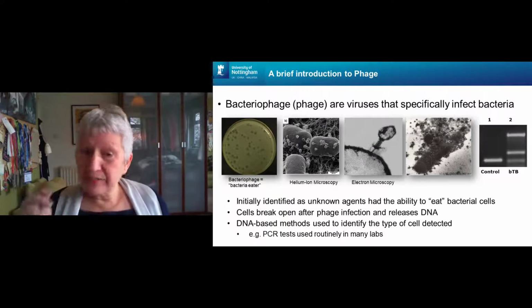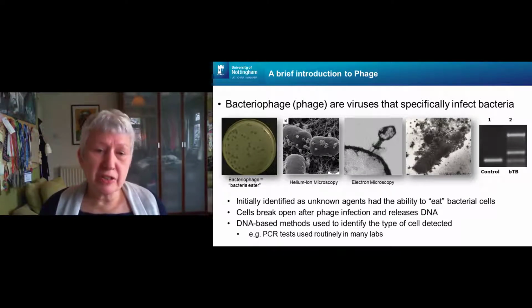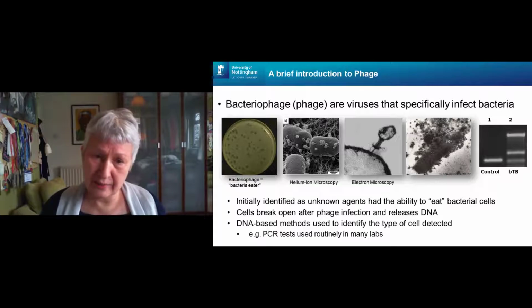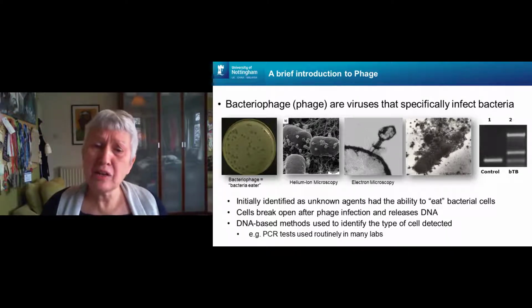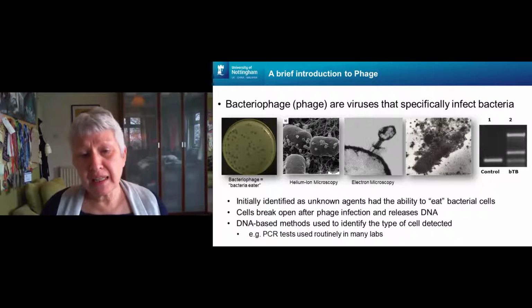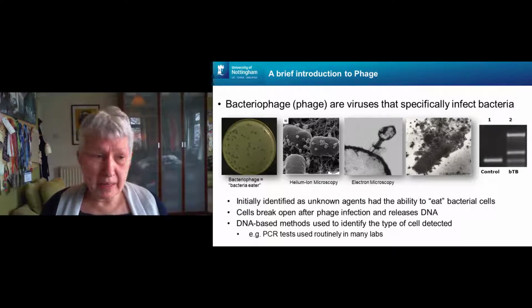Now, what we discovered, and has caused a bit of a game changer for us, was that during this process, this particular virus does not degrade the host cell DNA. And so during this lysis event, the DNA from that host cell is preserved, and we can then use this as a DNA extraction method to recover DNA that we can use to detect using conventional PCR-based methods.